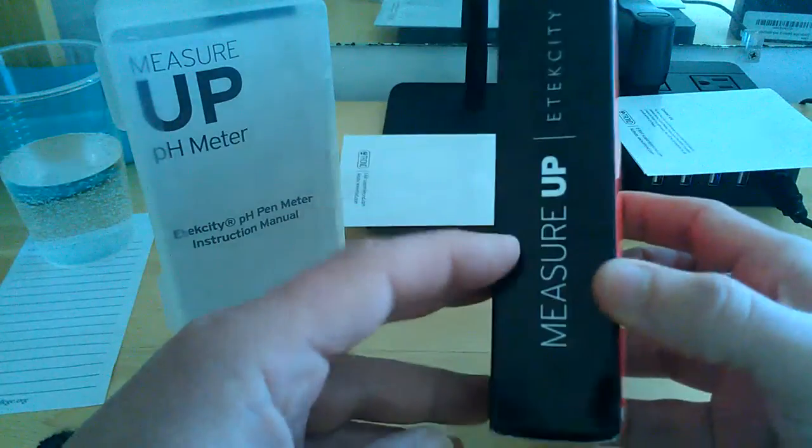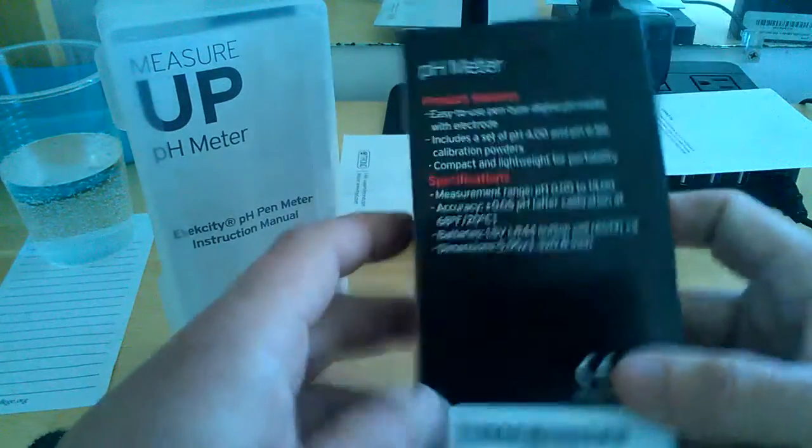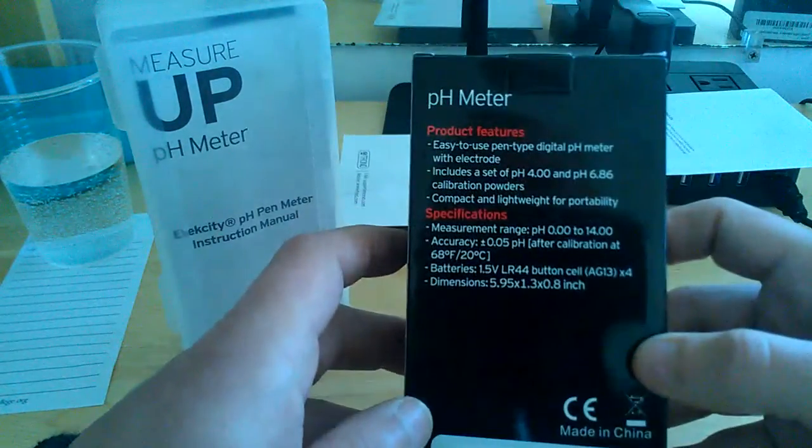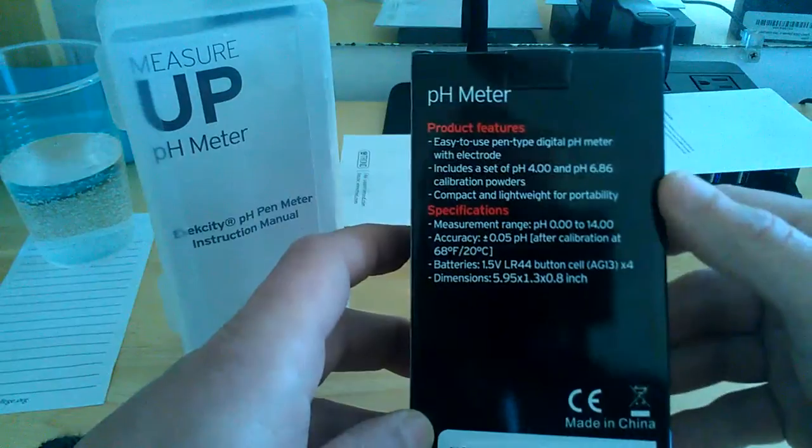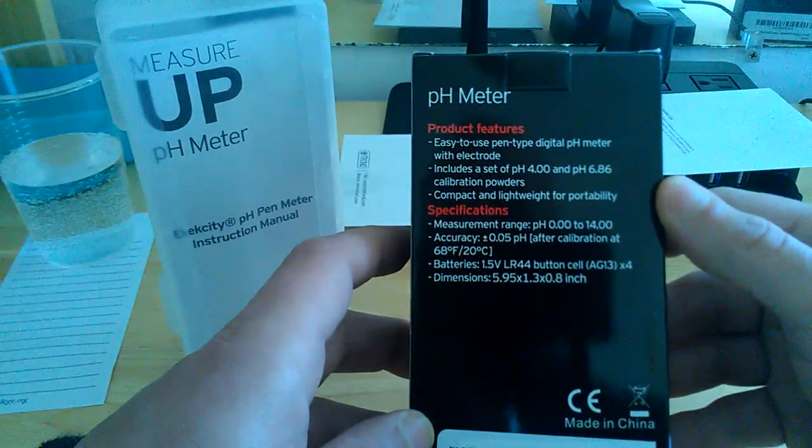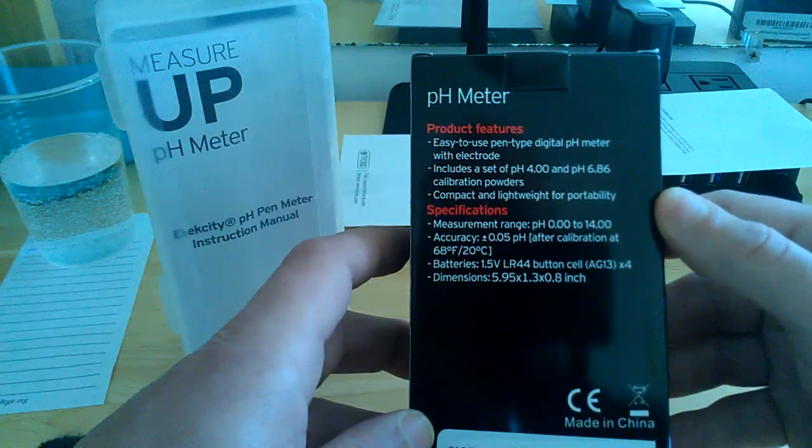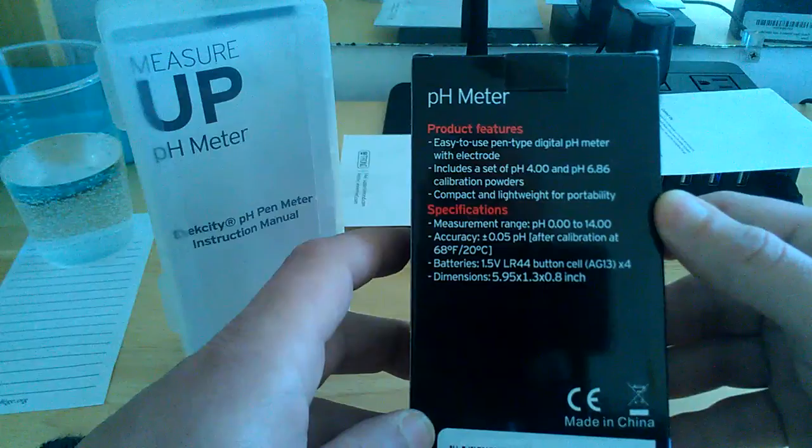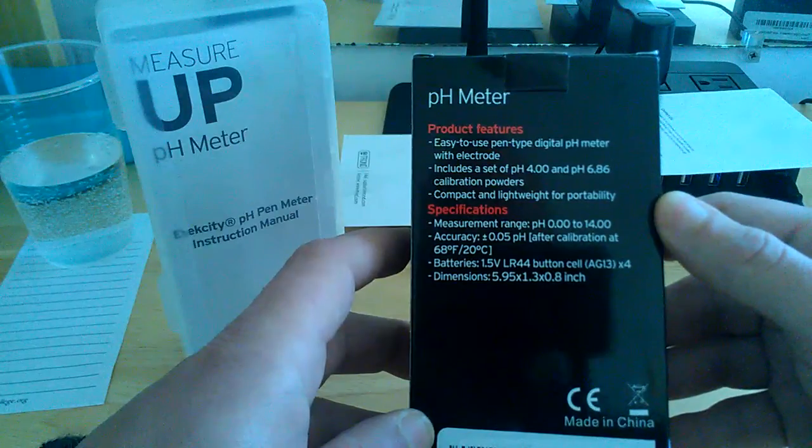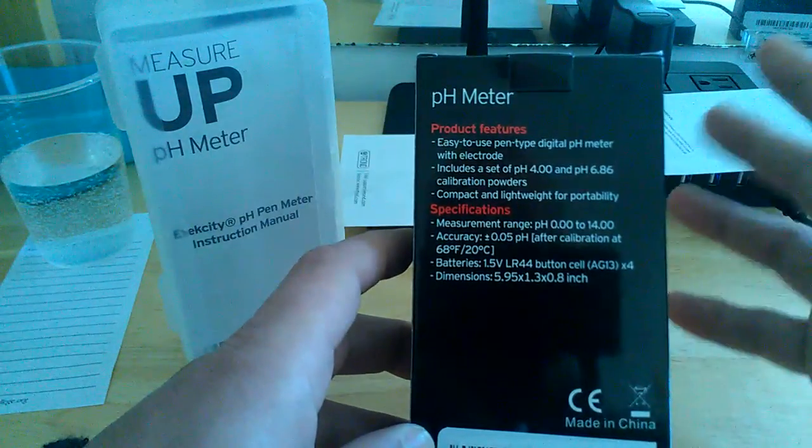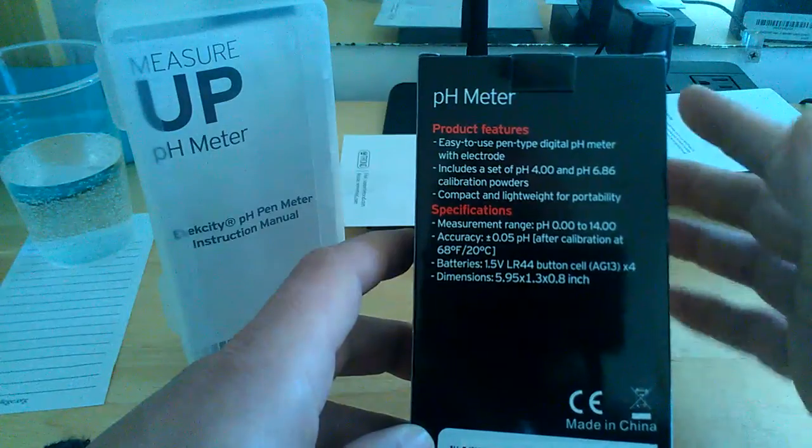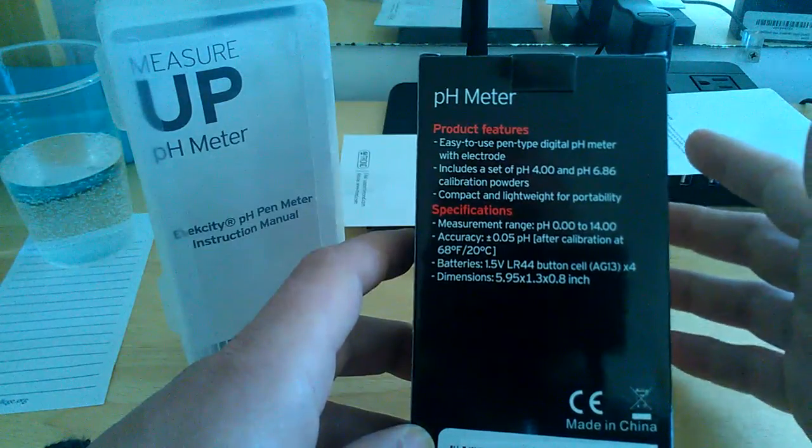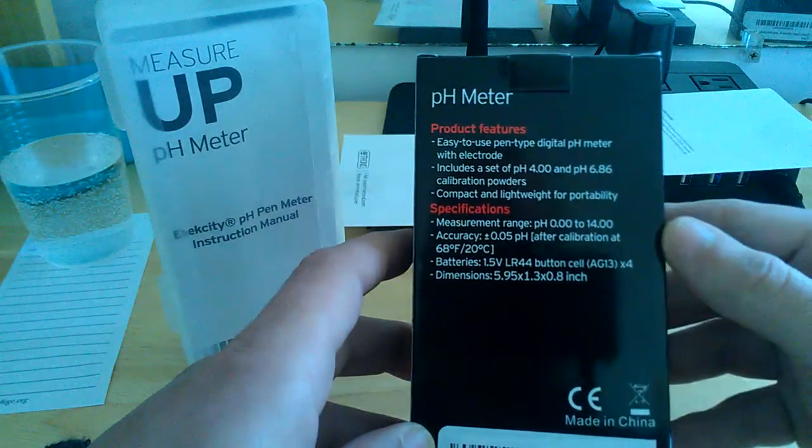Like I said, it's from their measure up line. The product features easy to use pen type digital pH meter with electrode. Includes a set of pH 4 and pH 6.86 calibration powders. Now what you use those for is a more precise reading, depending on the fluid that you are testing.